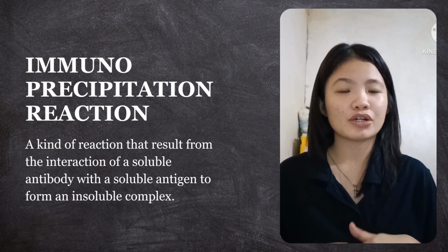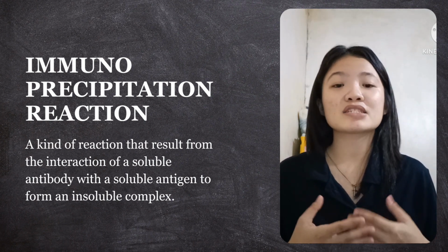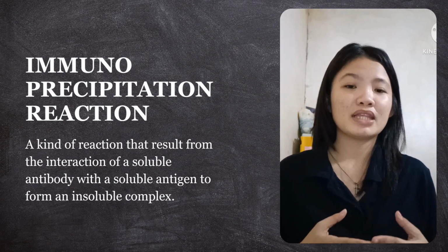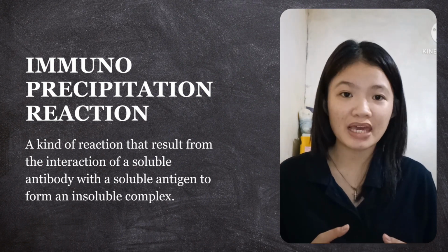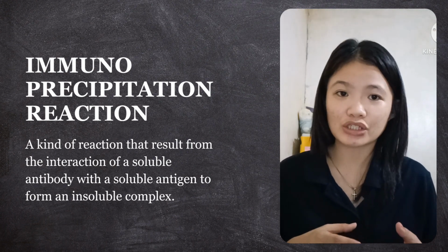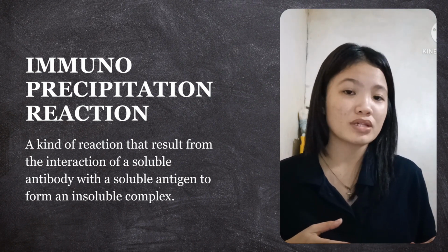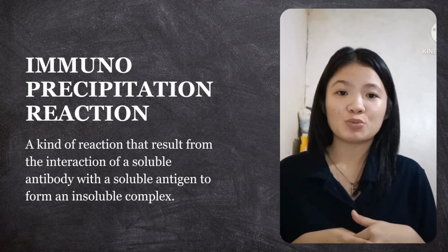So immunoprecipitation is an antigen-antibody interaction or binding that is highly specific, similar to biomolecular enzymes and substrates. The binding between the antigen (AG) and antibody (AB) is a weak and reversible interaction that consists of different forces: van der Waals forces, hydrophobic forces, electrostatic forces, and hydrogen bonding.